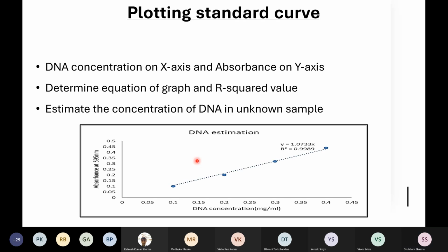This experiment is over here now. But I was talking about in the first slide that in this procedure, what happens? Only deoxyribose sugars give you the absorbance, right? And only the deoxyribose sugars that are attached to the purines give you the absorbance. So the actual absorbance values and the actual concentration should be half of the DNA. So can anyone tell me why we are not doubling the DNA concentration that we are obtaining here?